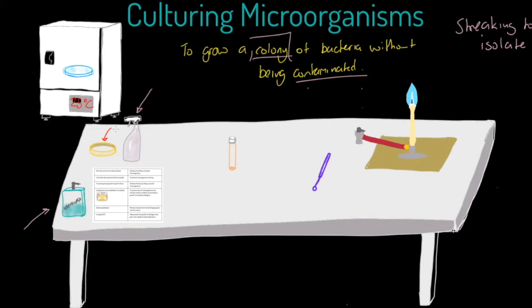Now let's look at the details of our streaking to isolate technique. From a bird's eye view of the petri dish, we take our lid just off to get the inoculating loop inside. We identify zone one of our agar plate and, with the inoculating loop, we provide a zigzag streak across that zone.